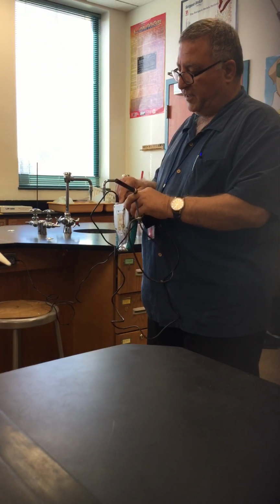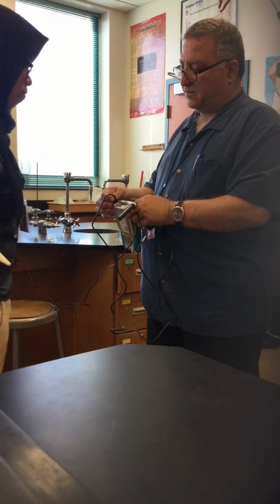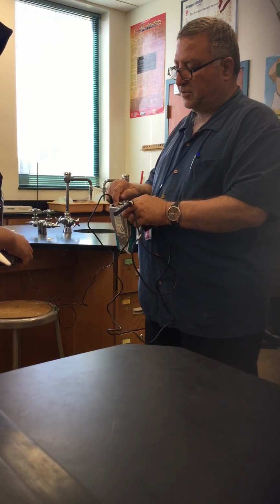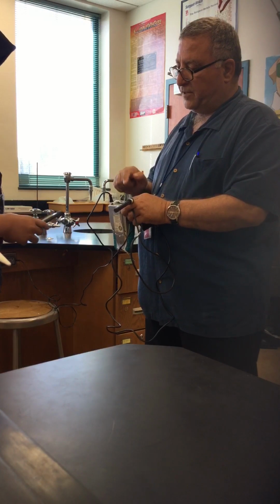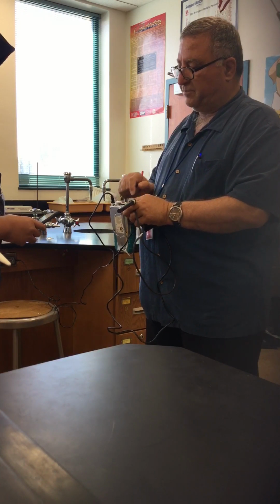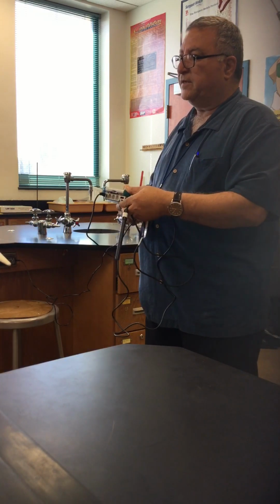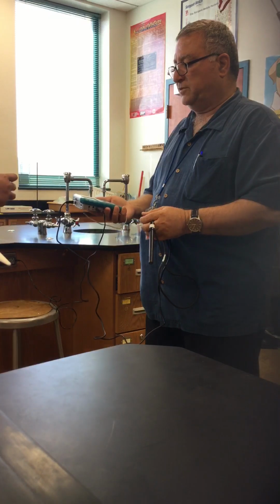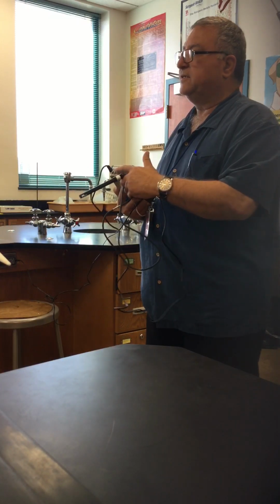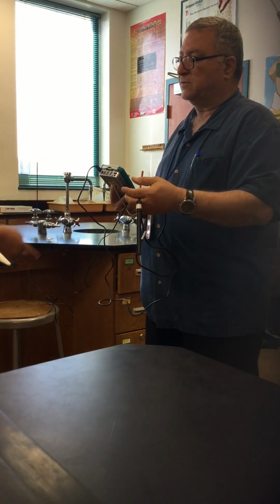We have 4 channels here. We can connect a conductivity probe, a temperature probe, a gas pressure probe, or we can measure the pH. What it measures depends on which channel you use and what kind of electrode you connect.